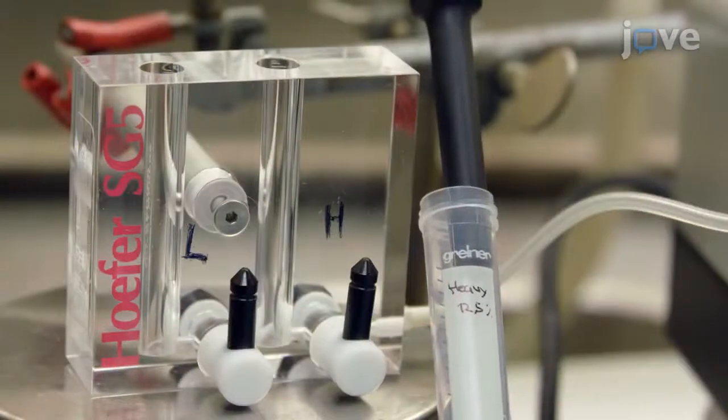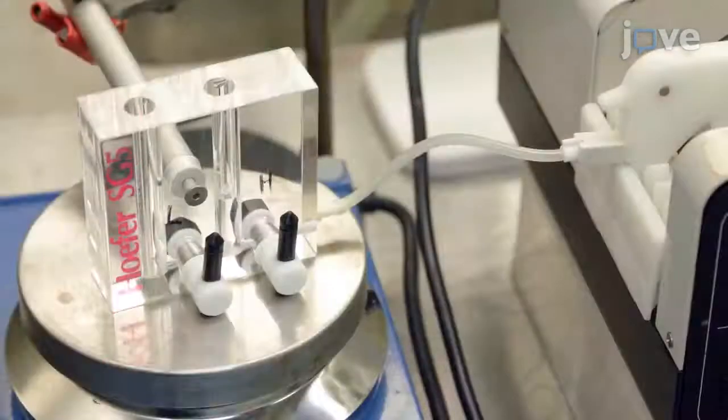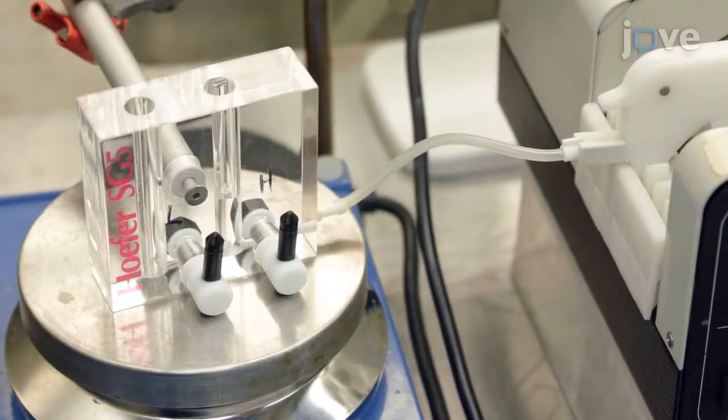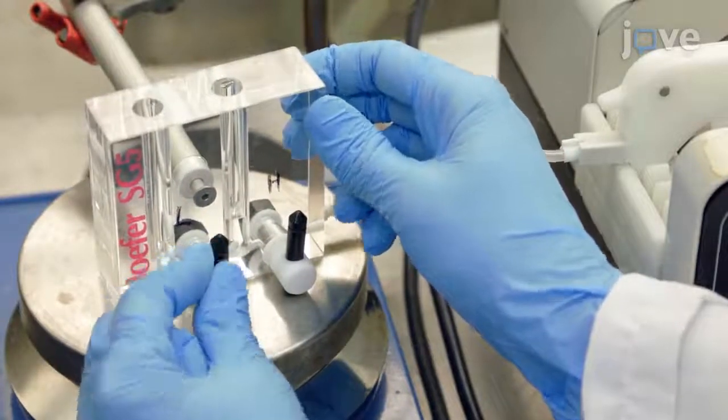Pipet the 12.5% solution to the heavy chamber. Remove air bubbles from the channel connecting the light and heavy chambers by opening the valve connecting the two chambers, allowing solution to enter the light chamber.